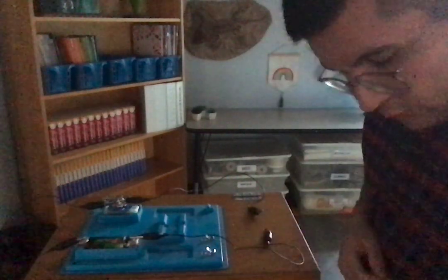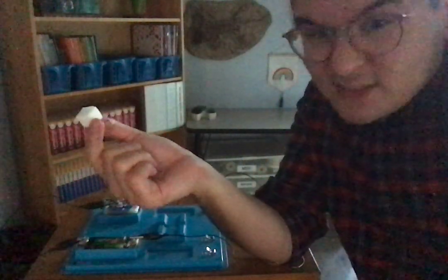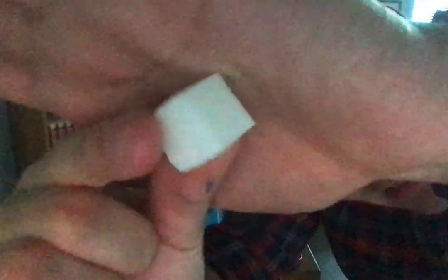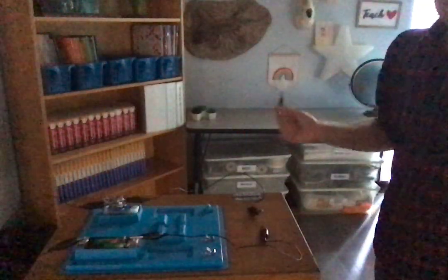Alrighty, next material we're going to test is sugar. I'm using a sugar cube, which is just sugar that's in the shape of a cube. I'll zoom in, I'll go up close so you can see exactly what that looks like. It's just a cube of sugar. If I want to break it apart, there's sugar that comes off, okay? Don't eat this, at least not in the lab. So let's test and see.